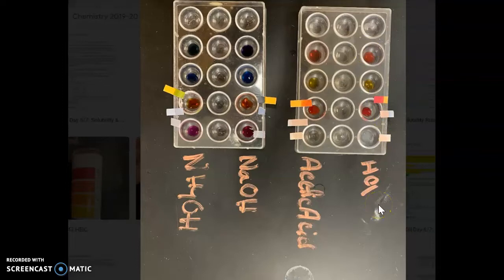For the first boxes for the litmus paper, the red litmus paper didn't change. The blue litmus paper turned red. And then the pH paper turned a deep red, which indicates a 1.0 pH.